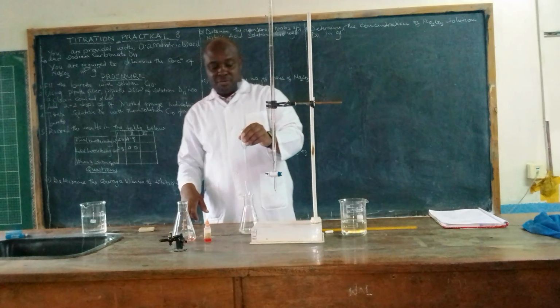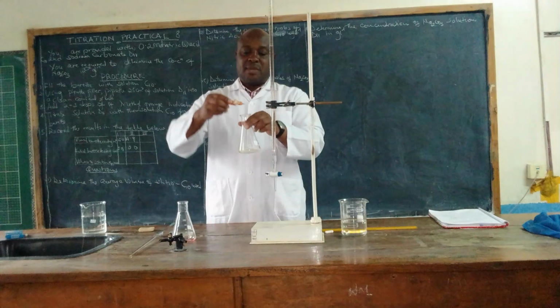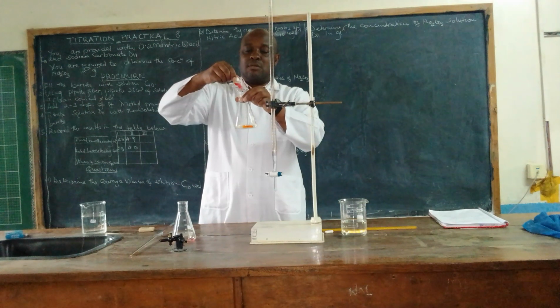Good. Now, we are done with that. As usual, we are supposed to put the indicator. So, we are putting 1, 2, 3.